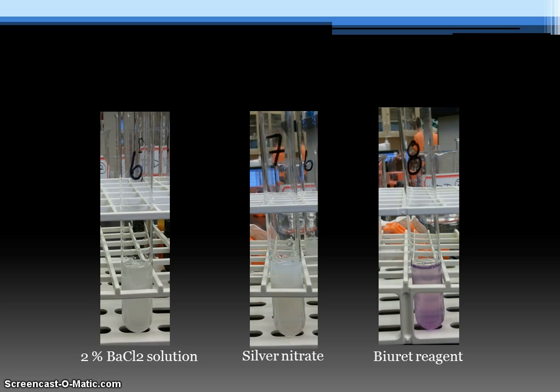So what we ended up doing was looking on with another group's experiment and also researching on our own to find out the solute movements within these solutions.